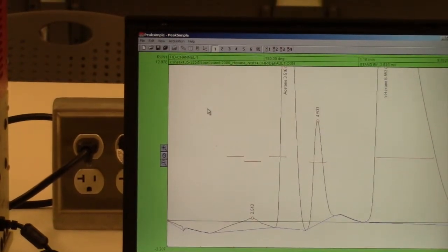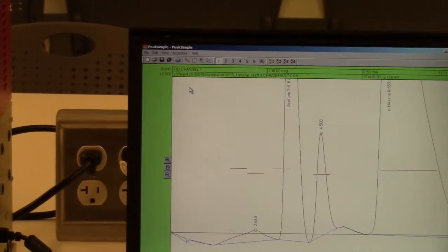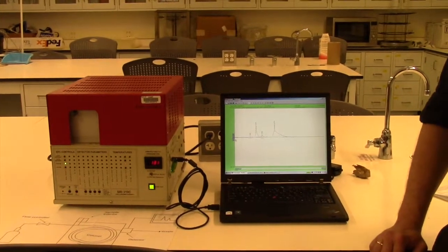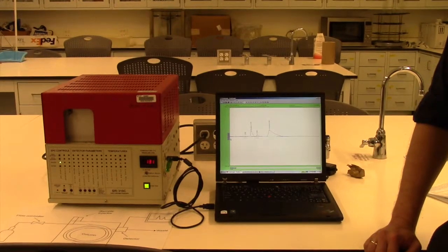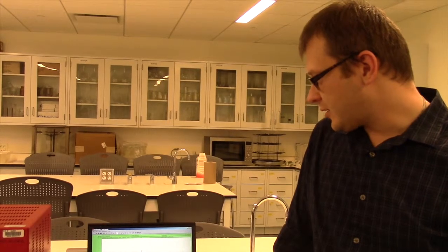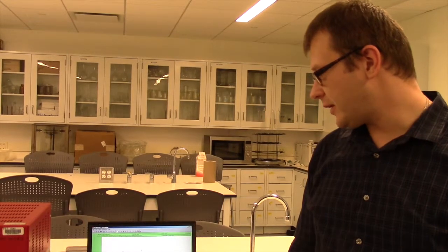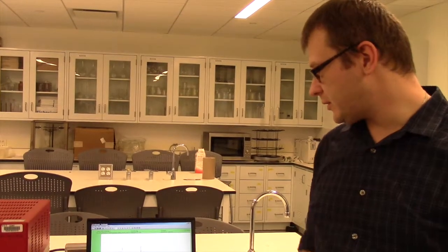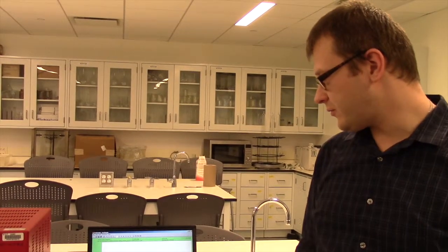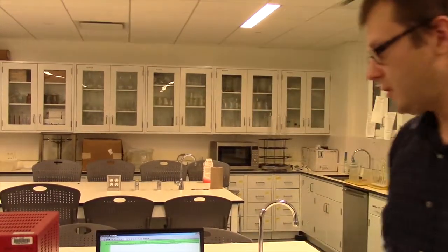So from this exercise we can conclude that gas chromatographs are powerful tools in any lab, and this particular example shows us just one way of using it: verifying concentrations of solutions.